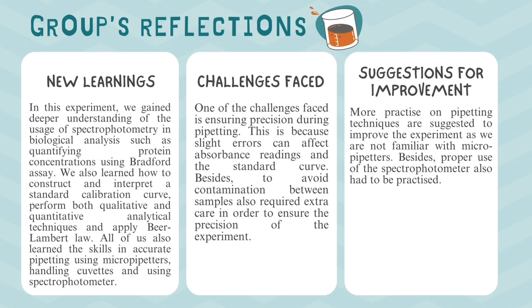One of the challenges faced during the experiment is ensuring precision during pipetting. This is because slight errors can affect absorbance reading and the standard curve. Avoiding contamination between samples also required extra care in order to ensure the precision of the experiment.